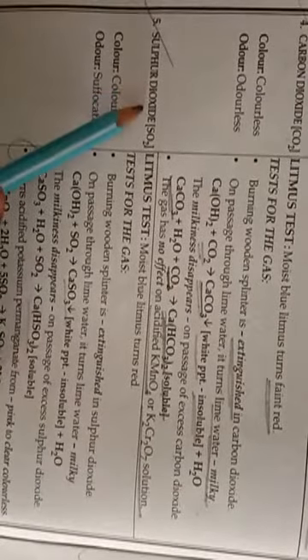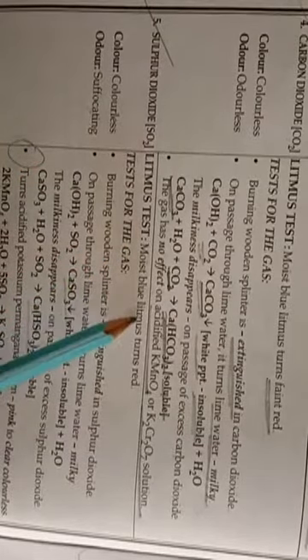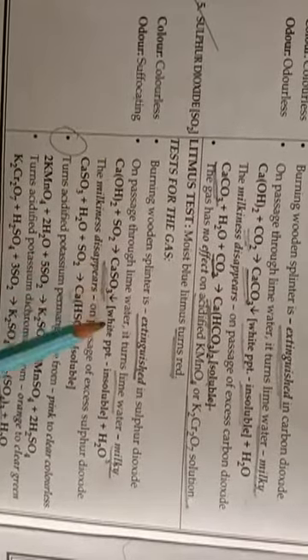Next, sulfur dioxide: a colorless gas with a suffocating odor. Litmus test: moist blue litmus turns red. Tests of the gas: a burning wooden splinter is extinguished, meaning SO2 is also a non-supporter of burning. Second, on passing through lime water, it turns lime water milky, the same observation as in the case of CO2 gas. But here the milkiness of lime water is due to the formation of calcium sulfite, which is white in color and also insoluble in water. So calcium sulfite forms when we pass SO2 gas in lime water, and that is why lime water turns milky.